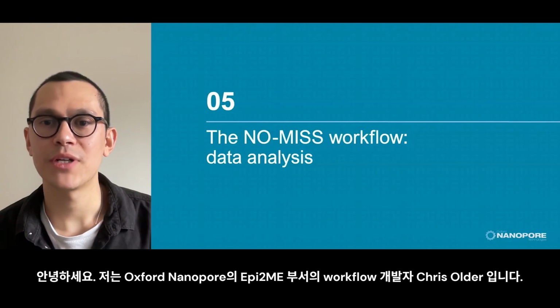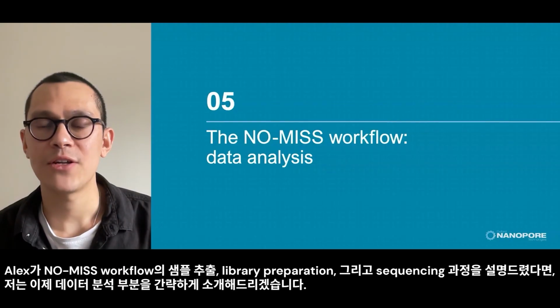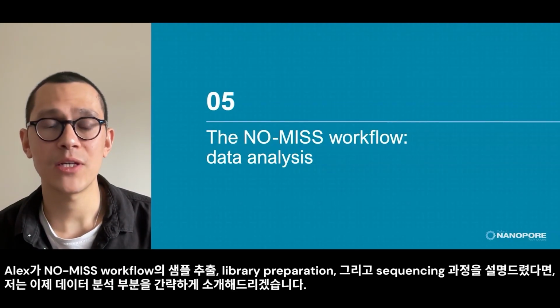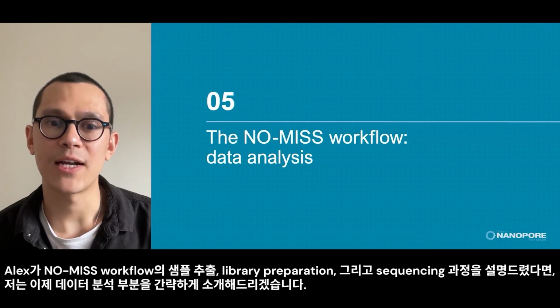Hi, my name's Chris Older. I'm a bioinformatics workflow developer within the EPI2ME team here at Oxford Nanopore. Alex has taken you through the extraction, library prep, and sequencing portion of the NOMIS workflow, and I'm here to briefly go over the data analysis side.